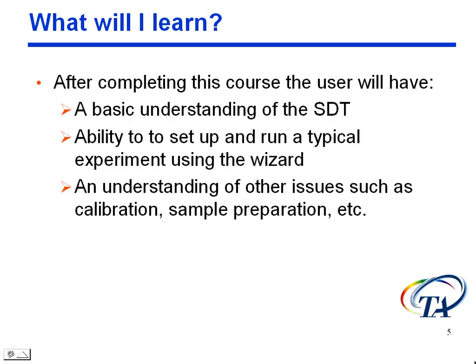Now, a couple basic things. What do we want you to learn out of this course? After completing this course, you should have a basic understanding of the SDT, the ability to set up and run a typical experiment using the wizard, and an understanding of other issues such as calibration, sample preparation, etc.